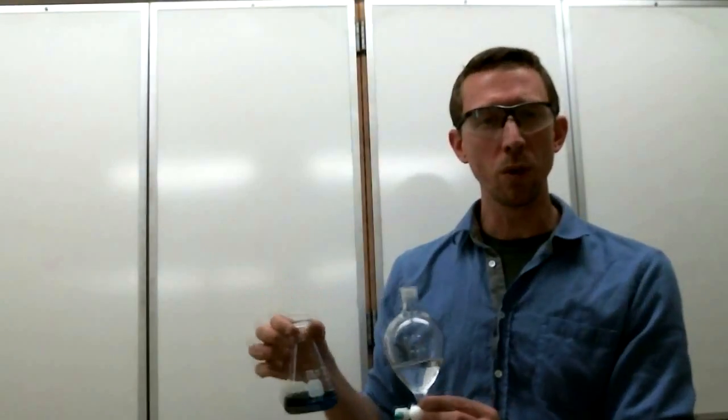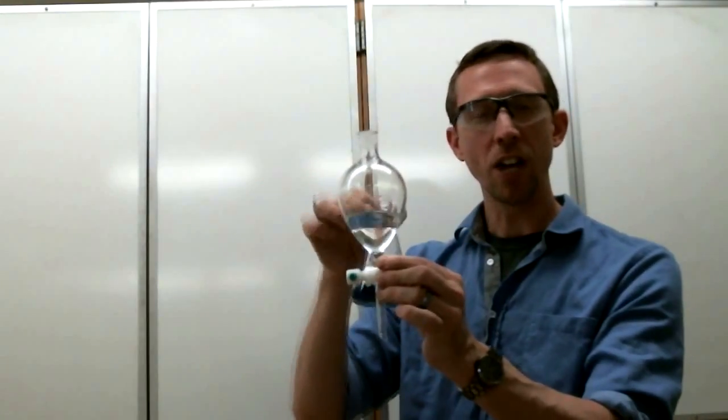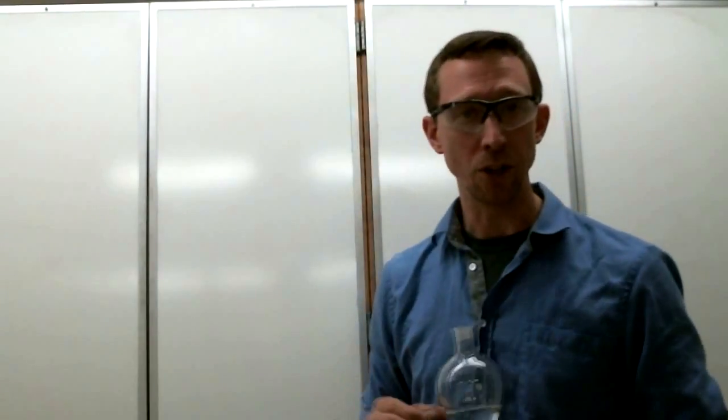I'm going to do something you wouldn't do in a normal liquid-liquid extraction. And that is, I'm going to add this solution very, very carefully, layering it on top of the deionized water in the separatory funnel. And as soon as I get that done, I'll be right back to show you how liquid-liquid extraction works.